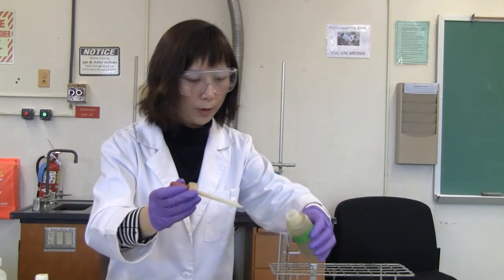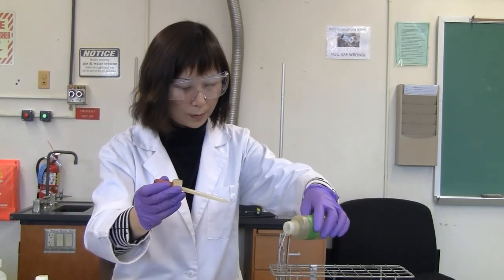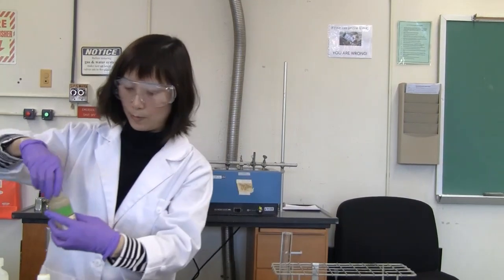I'm going to just pour it. About 3 milliliters.